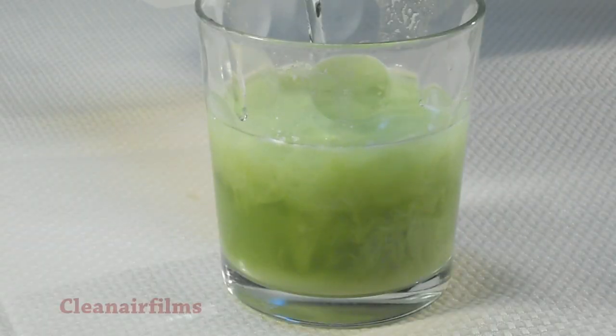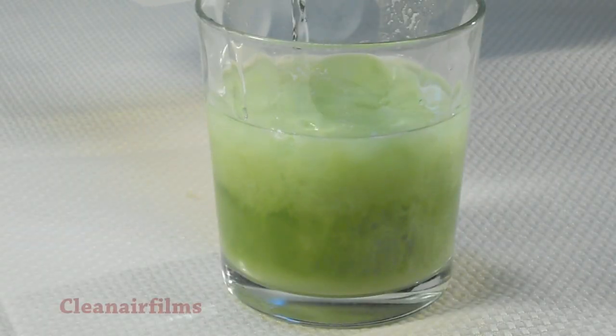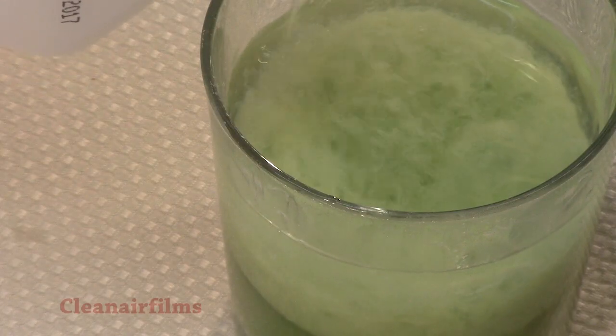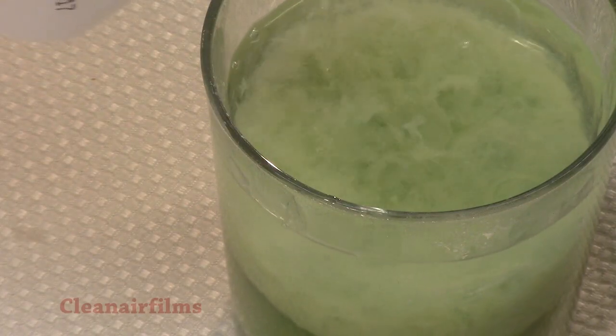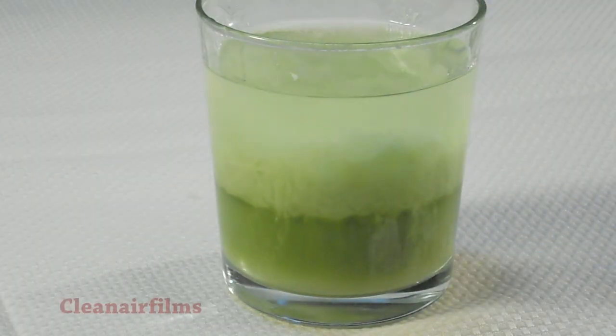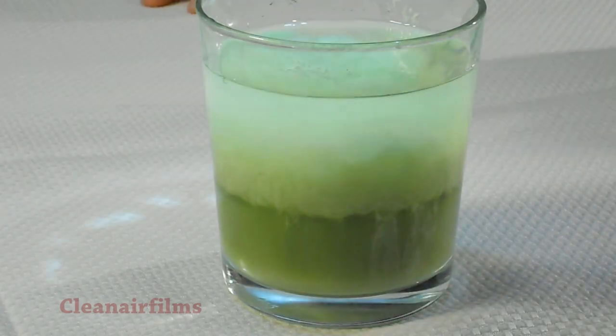Now we will add an equal amount of rubbing alcohol. Add slowly — we want the alcohol to remain on top of the mixture. You should begin to see the DNA float to the top. The DNA can be hard to see, so you may use a flashlight.